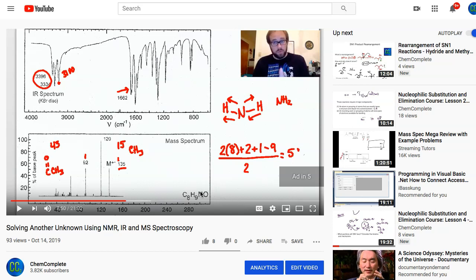present here. Now I want you guys to realize that when you have a molecular formula, there are usually going to be several structures that it could potentially be. So just stating a given formula is not always going to lead directly to that structure. So you always want to pay attention to what the spectra is actually going to tell you.